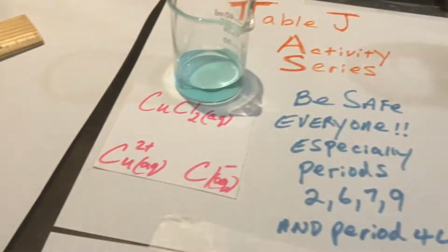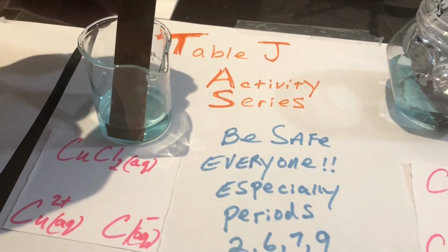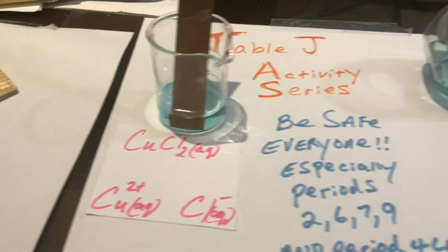And it kind of makes sense, right? That copper essentially will not react with itself. So copper ions and copper solid, there is no reaction. If you kind of figured that out, very good.